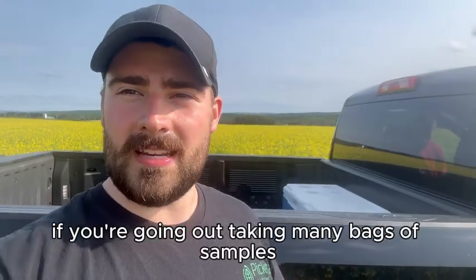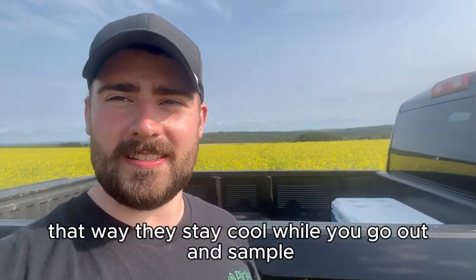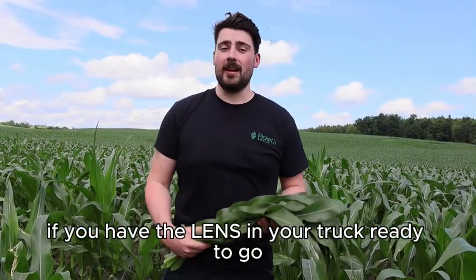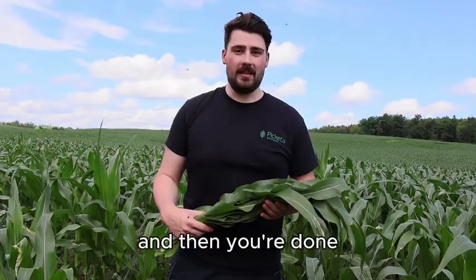If you're going out taking many bags of samples, you might want to put a cooler in your truck. That way they stay cool while you go out and sample. Once you have your sample collected, you can make your way to the side of the field. If you have the lens in your truck ready to go, you can scan them directly there and discard them next to the field, and then you're done.